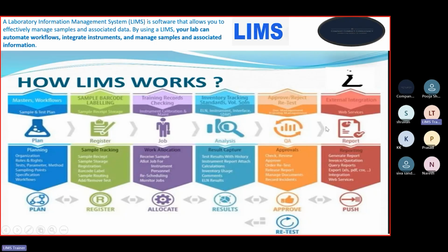After that comes the report phase. After approving the test, the report generation will take place: generate report, invoice quotation, query reports, export, integration, web services. That is the last phase of the LIMS. So report generation. Okay, so this is how LIMS works, and we are going to explain this workflow in our training.